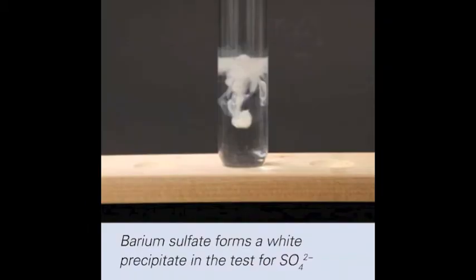To identify aqueous sulfate ions, SO4-2, a few drops of dilute hydrochloric acid are added to the sample solution, which is then shaken. A few drops of barium chloride solution are then added. A white precipitate of barium sulfate forms if the sample contains sulfate ions.